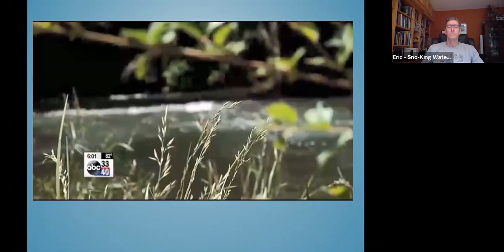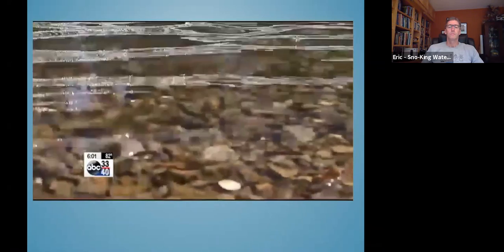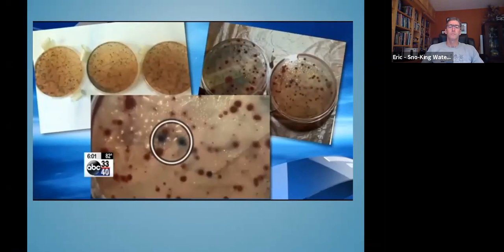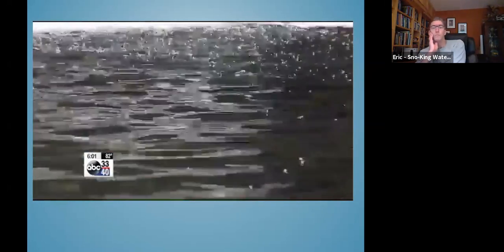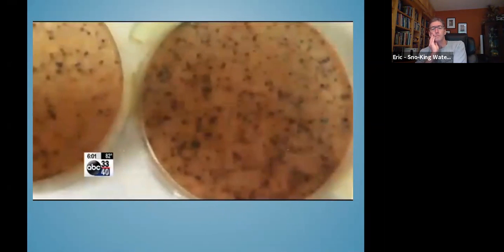Very few people are doing any kind of testing. The Cahaba Riverkeeper started testing 8 points along the Cahaba River last summer, starting at Buck Creek and ending at Trussville Springs. No one else is doing it. I think it's pretty important. The results were documented and photographed. The dark spots are E. coli. Crawford says unsafe levels were found in Buck Creek multiple times, but an April 14th sample set a new high. It's called too numerous to count. You can't even count the number of little dots.